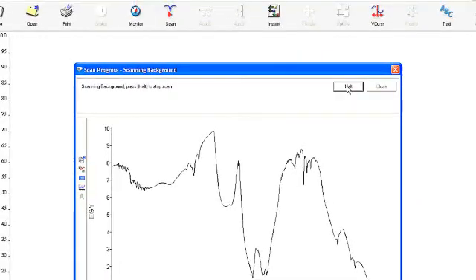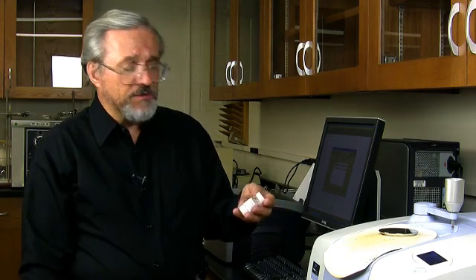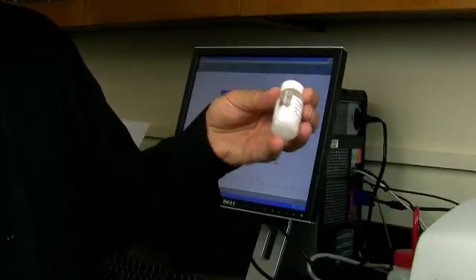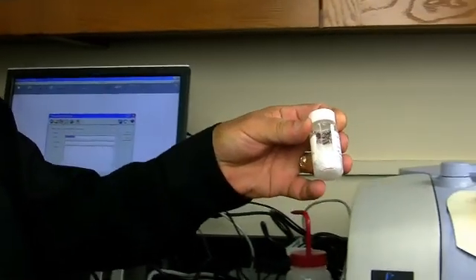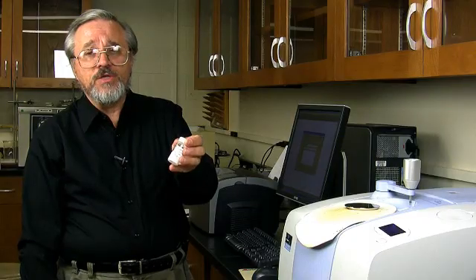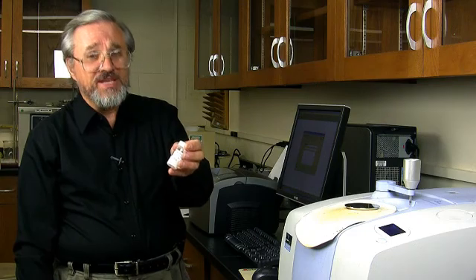Now, what we want to do is to take our sample. I've chosen a sample. It's a solid, a nice white solid, nice crystalline material, as you can see. This is 1,4-ditertiary butyl benzene.